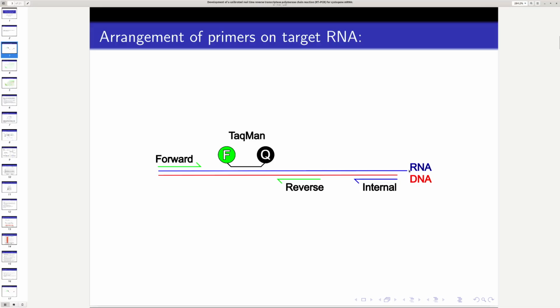So once we've made the RNA, we can then purify it, work out how much we've got, and because we know the molecular mass of the RNA, we can work out how many moles we've got, and then using Avogadro's number, determine how many copies we've got in a microliter. And usually we end up with about 10 to the 11 copies per microliter once we've finished this protocol.